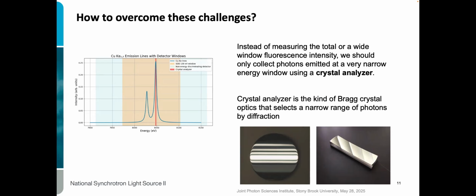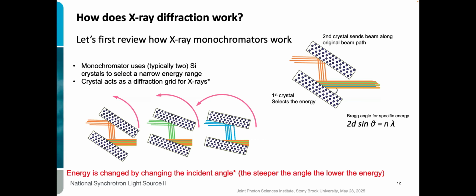And this would be, I mean, there's no scale here. I should have put it. It's about a 4 inch round thing, which is a silicon wafer or germanium wafer, polished and processed in a certain manner, or there are other kinds. But before I go into this, let's talk about the first time when we use X-ray diffraction.